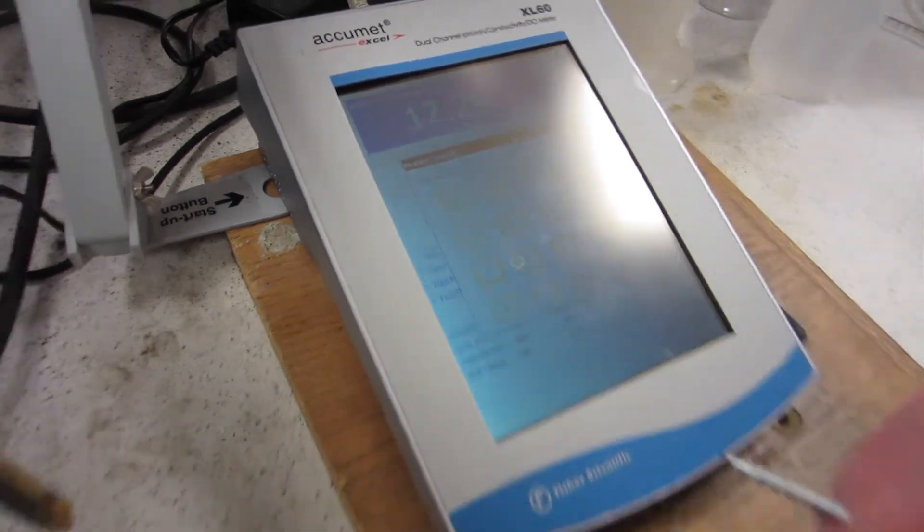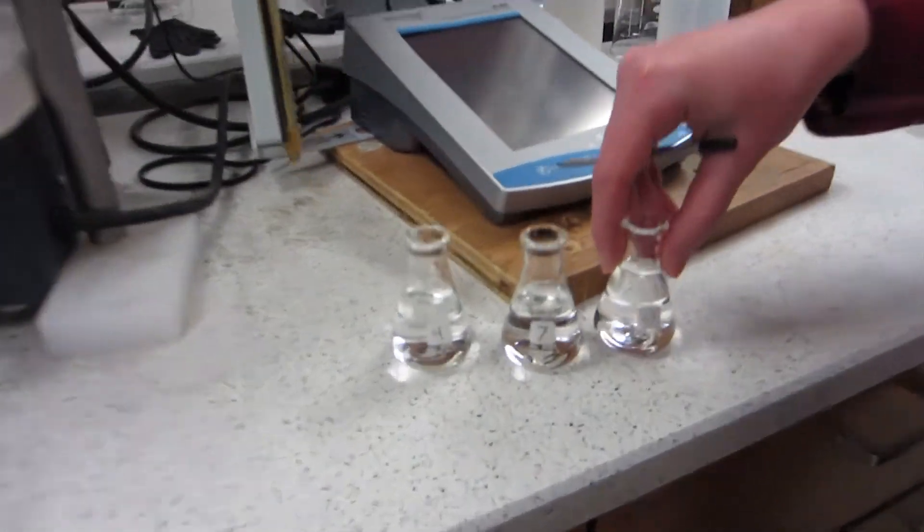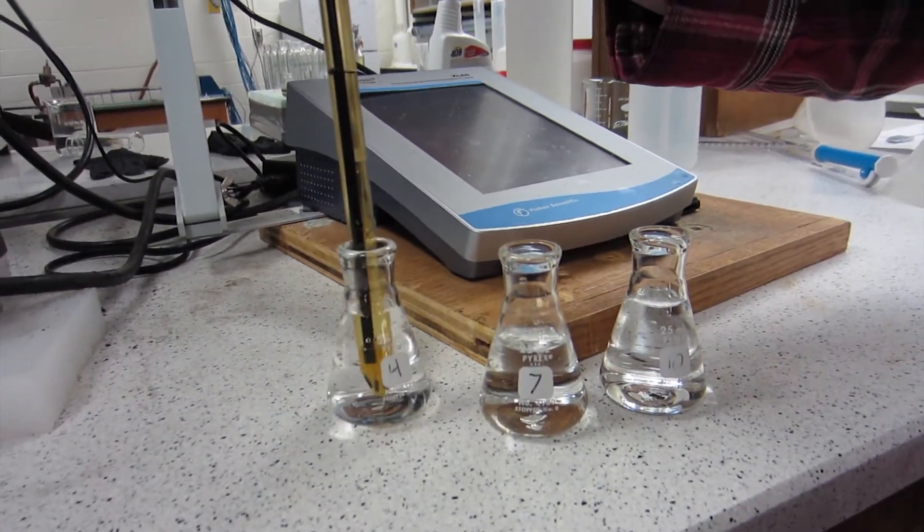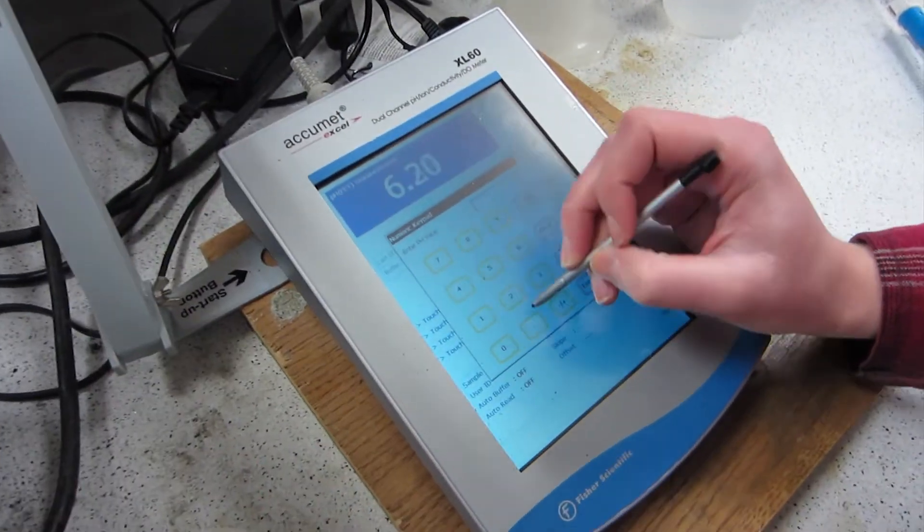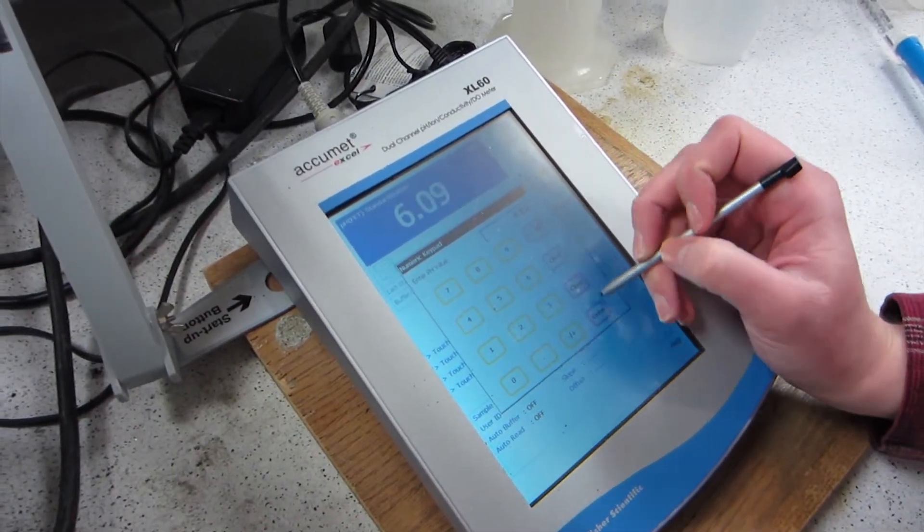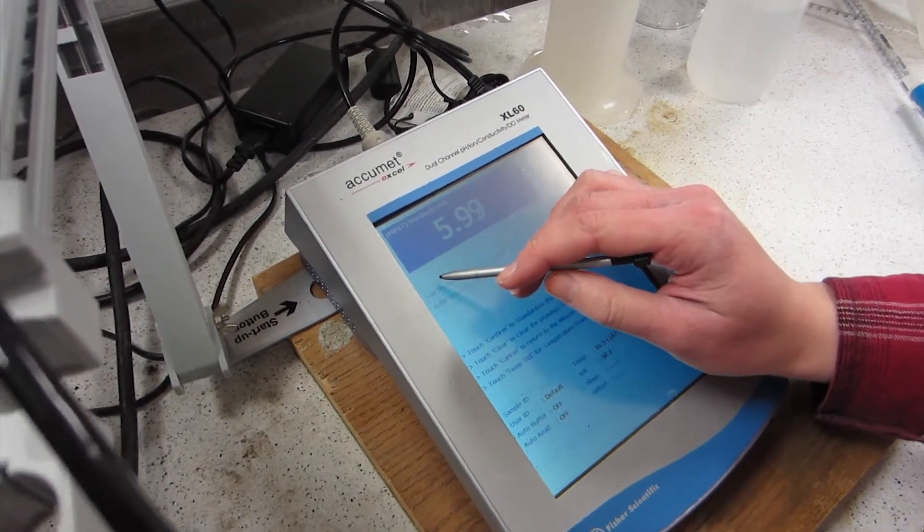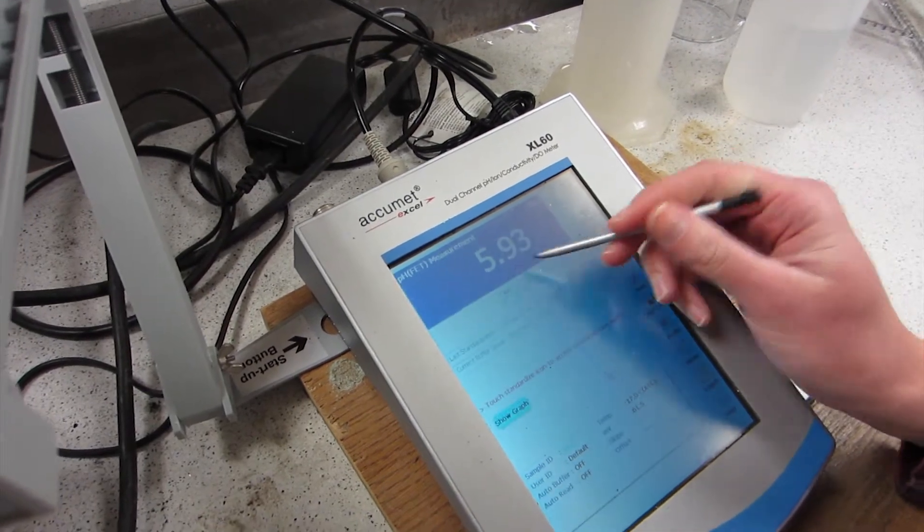Then what you're going to do is use your 4 pH, 7 pH, and 10 pH buffers. You're going to insert the probe in each buffer, and then wait until this screen shows up asking what pH it is. In this case, it's 4.01, and you're going to enter that in. Then it's going to flash at you, and you want to hit confirm to make sure that it takes. So it has that one standardized.